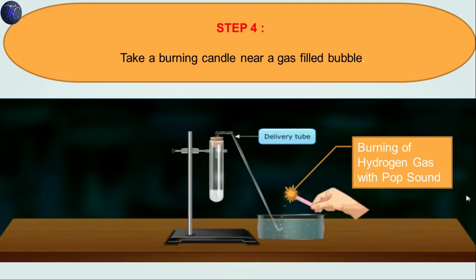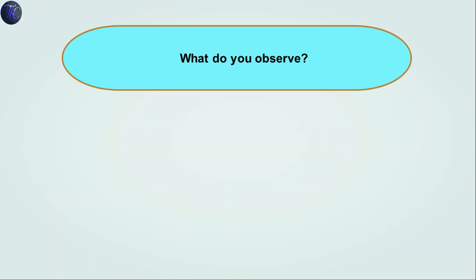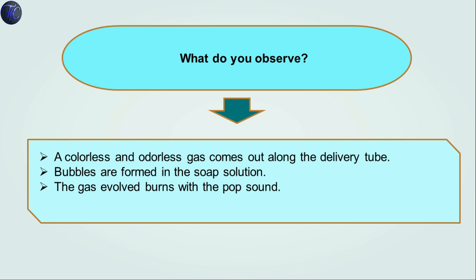Step 4: Take the burning candle near the gas-filled bubbles. What we will observe here is burning of hydrogen gas with a pop sound and the candle will put off. A colorless and odorless gas comes out along the delivery tube. Bubbles are formed in the soap solution. The gas evolved burns with a pop sound which shows the presence of hydrogen gas.